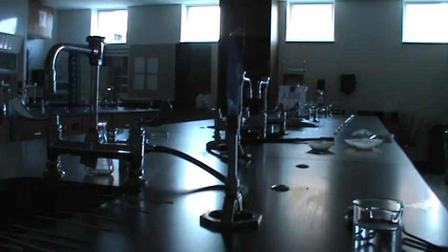Alright, so hopefully you can kind of see those sparks and everything. Let's try our next one, which is strontium chloride, or we're going to look at strontium. Let's see what color we get for this one.